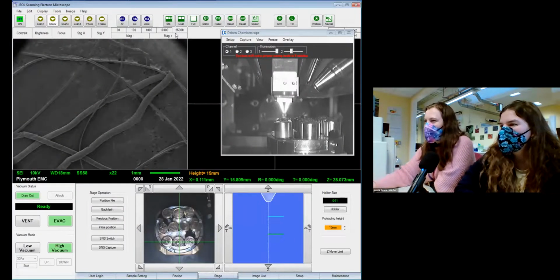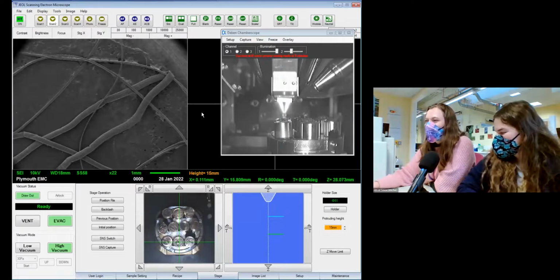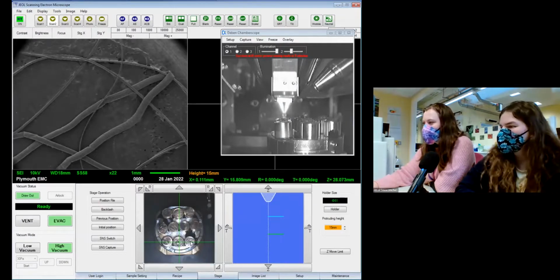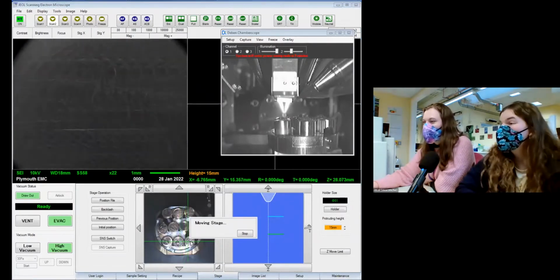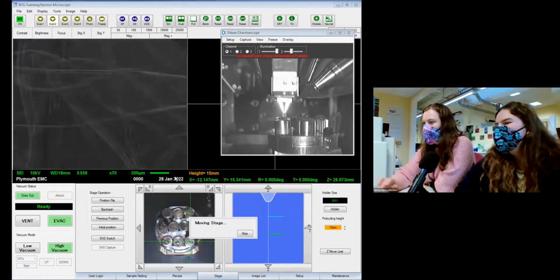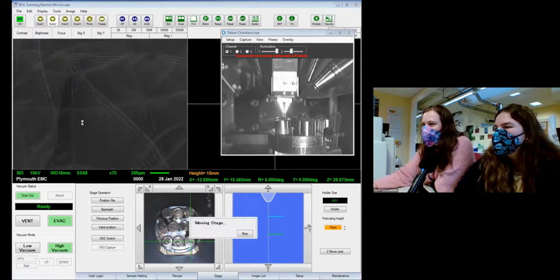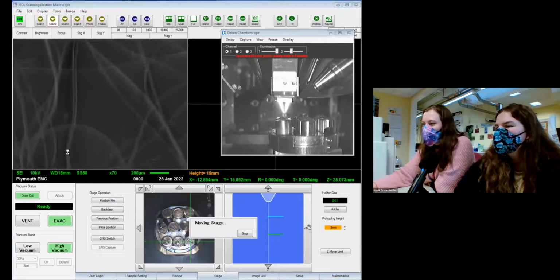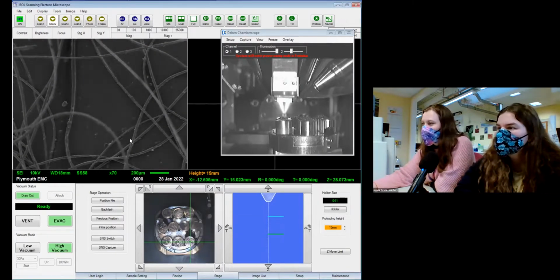Amazing. So it's been a very whirlwind tour today, a whirlwind tour of lots of different animals, lots of things to show you. But our last sample is some tiger hair. See how different it is to Wanda. We don't have any tiger claws though. No, which is probably fine. So it's very different. It's much finer than the wolf hair. And it is really orange, actually, and the tube is really, really orange.